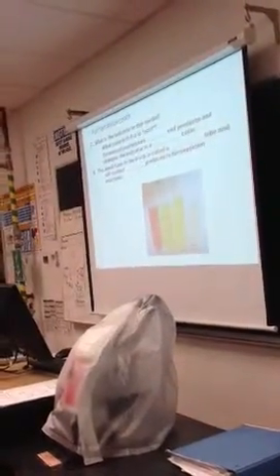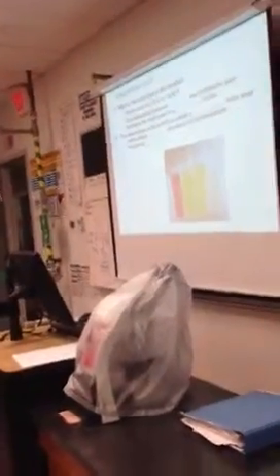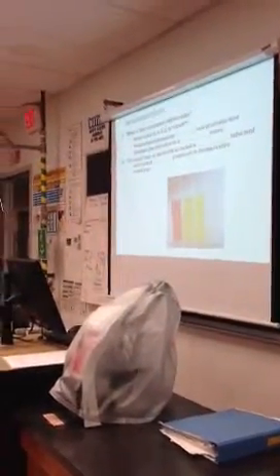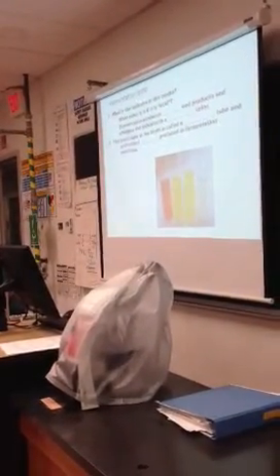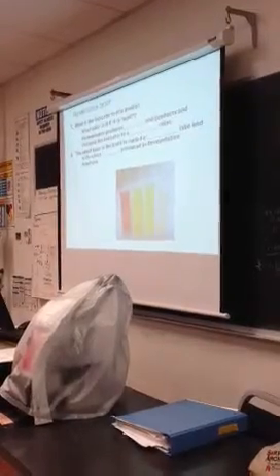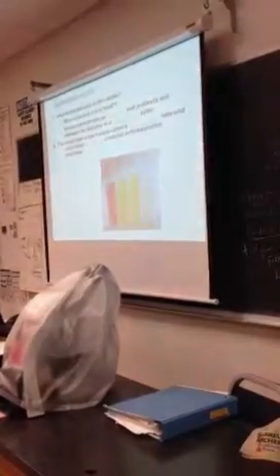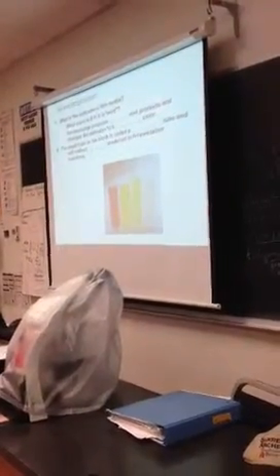Okay. Fermentation broth. We did that today. Okay? What's the indicator? Phenol red. What color is phenol red when it's acid? Yellow. Fermentation produces acid end products and changes the indicator to what color? Yellow. Okay, that's a little redundant, but it helps. The small tube is called what? A fermentation or Durham tube. And what will it collect? Gas. It collects gas.